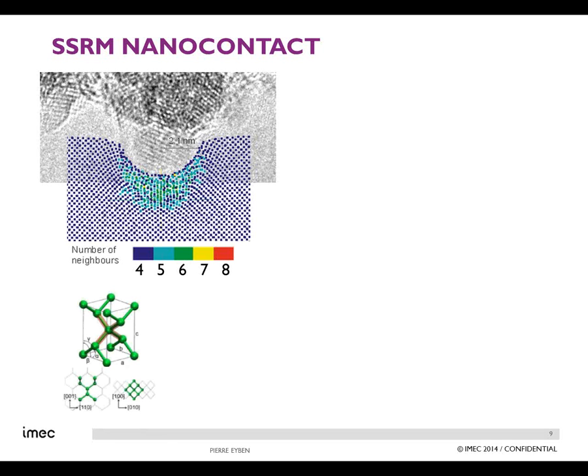Actually, what we are doing is making a phase transformation, starting from diamond cubic silicon, which has localized sp3 molecular orbitals. When we go to this high pressure, we generate a new phase, called silicon 2 or beta-tin silicon, which is a phase where every silicon atom no longer has 4 neighbors, but 6 neighbors, and where the sp3 molecular orbitals are replaced by sp3d2 molecular orbitals, in which d2 corresponds to non-localized electrons, meaning that we are generating a new phase of silicon, which is a metallic-like phase. And in the meantime, we also generate a volume reduction.